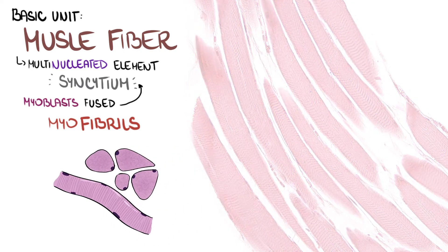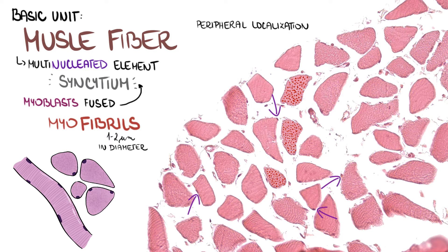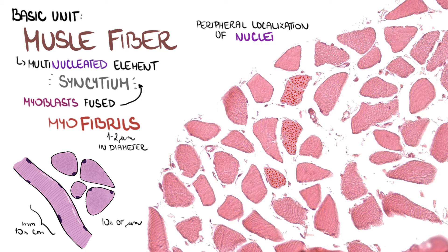Cross sections of myofibrils resemble small eosinophilic dots within muscle fibers, one to two micrometers in diameter. We can appreciate peripheral localization of nuclei in cross sections as well. Length of muscle fibers ranges from millimeters to tens of centimeters — just imagine how long your biceps is. On the other hand, the diameter is much smaller, just tens of micrometers.